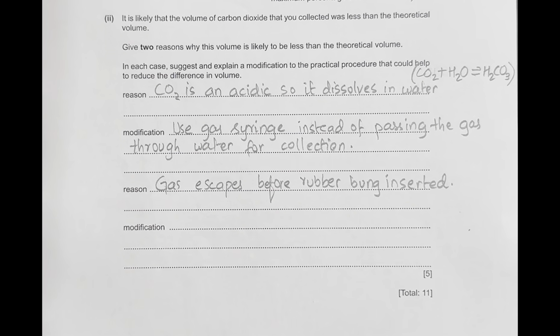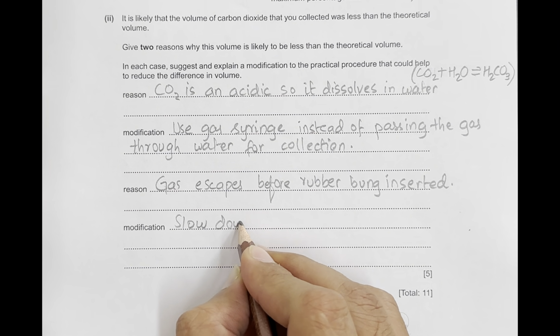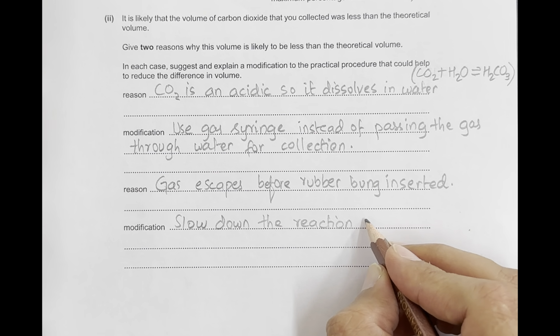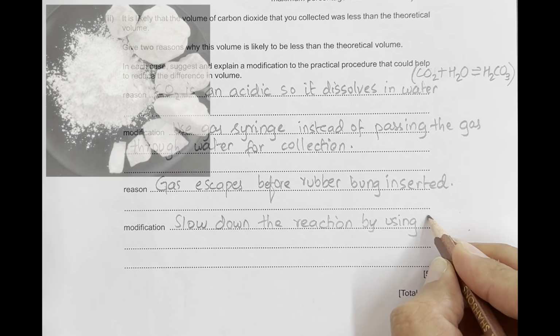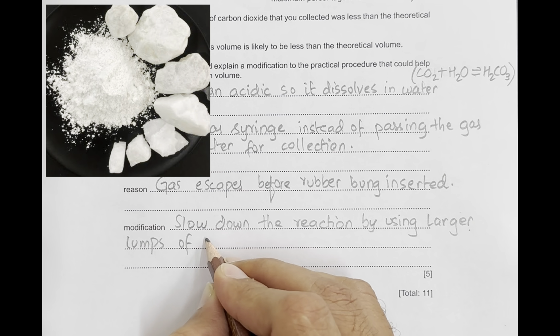We have used powder, and we know that the surface area of powder is greater. Therefore, if we want to slow down the reaction, there could be two ways you can do this. Number one, use larger lumps of metal carbonate.